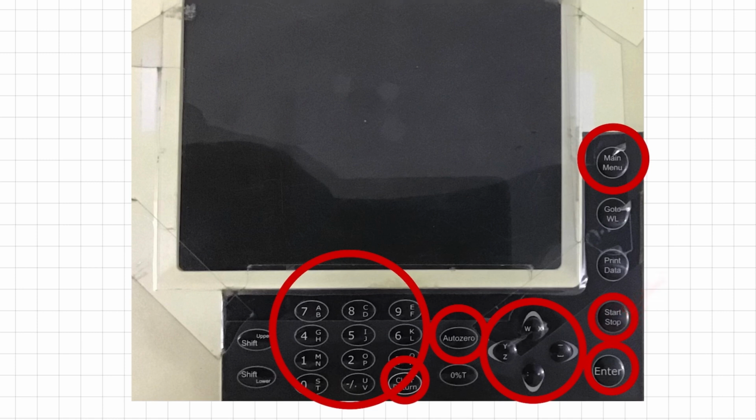However, one thing must be important: for the very first sample, before the start of this analysis, whenever we place our first standard, which is actually the blank solution, in order to have a good value, we will press the autozero button 1 or 2 times. Autozero means that the instrument ignores all the stray light, and if the blank solution absorbs some light, it will be calculated as 0.